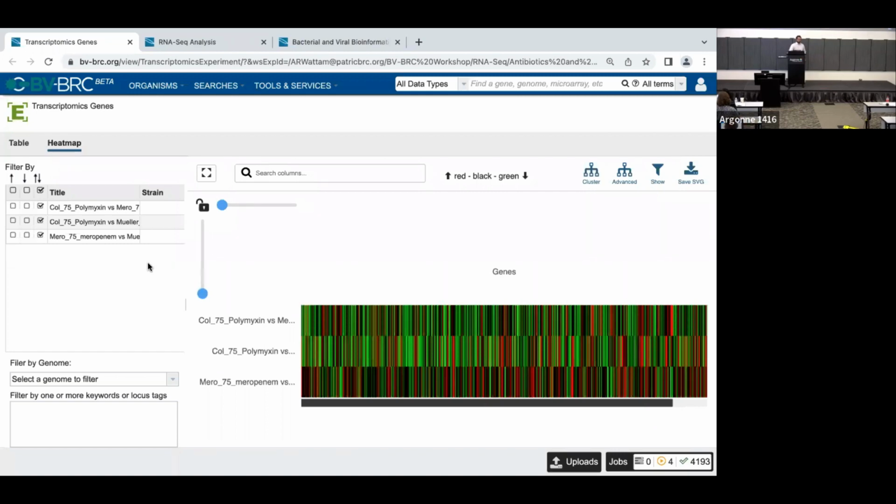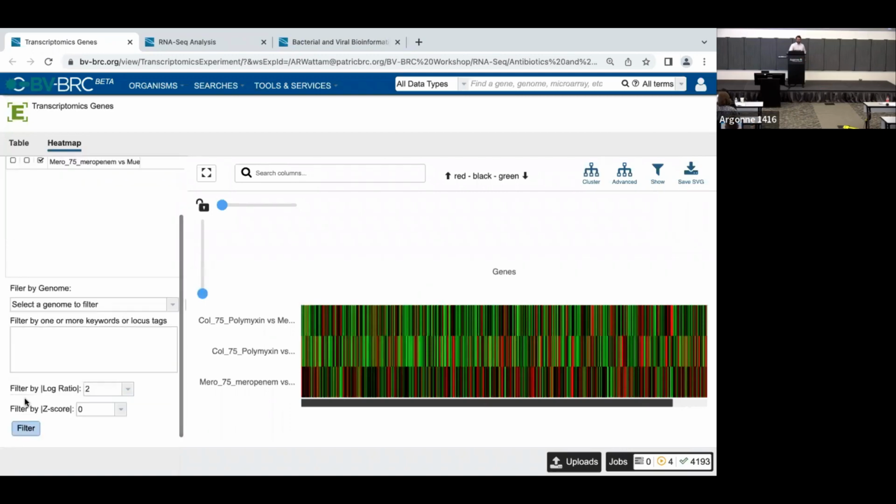That's also one of the future improvements we have in mind, to add a p-value filter so that you can actually perform that type of filtering. Exactly.